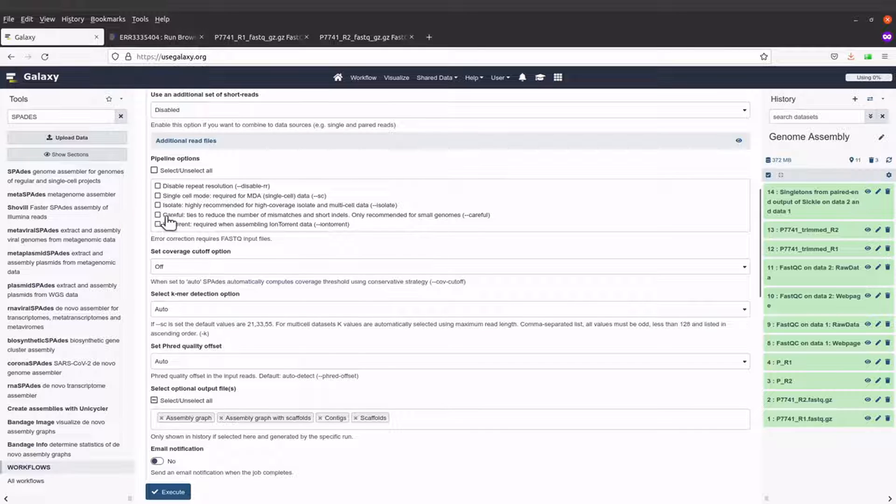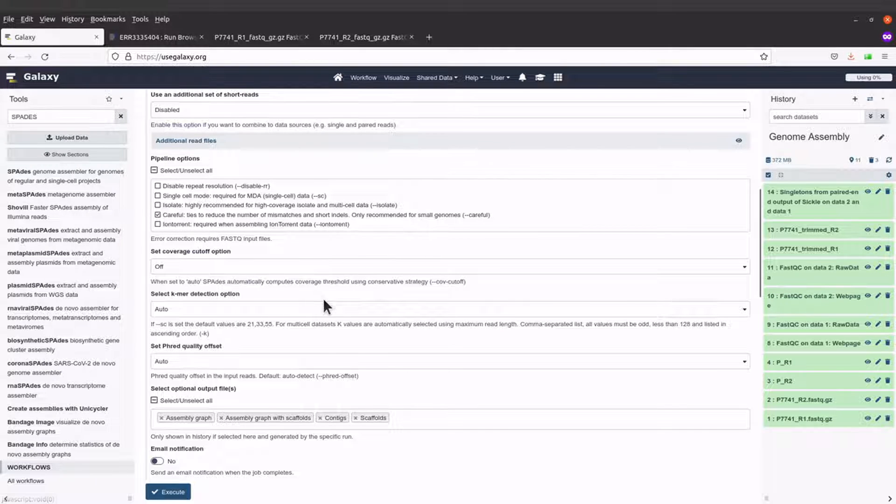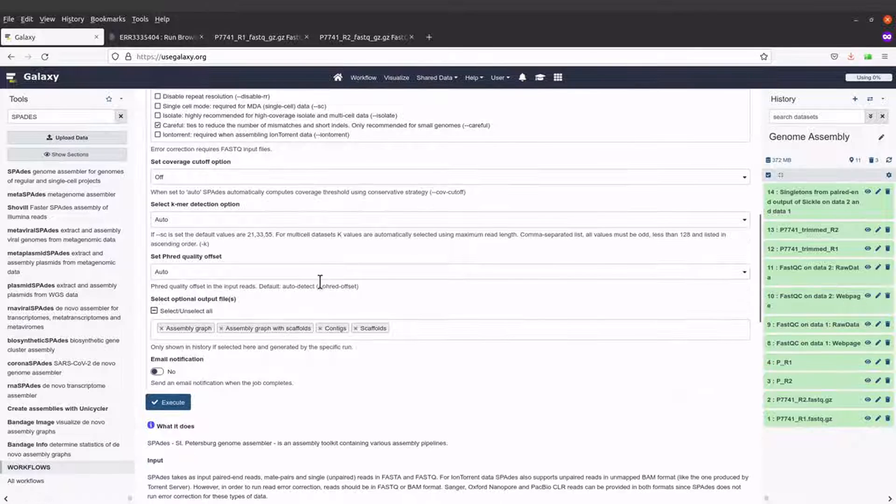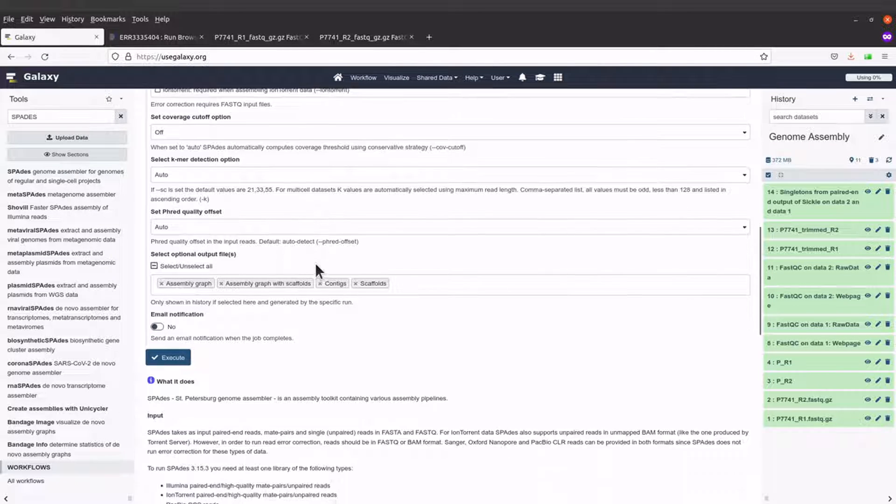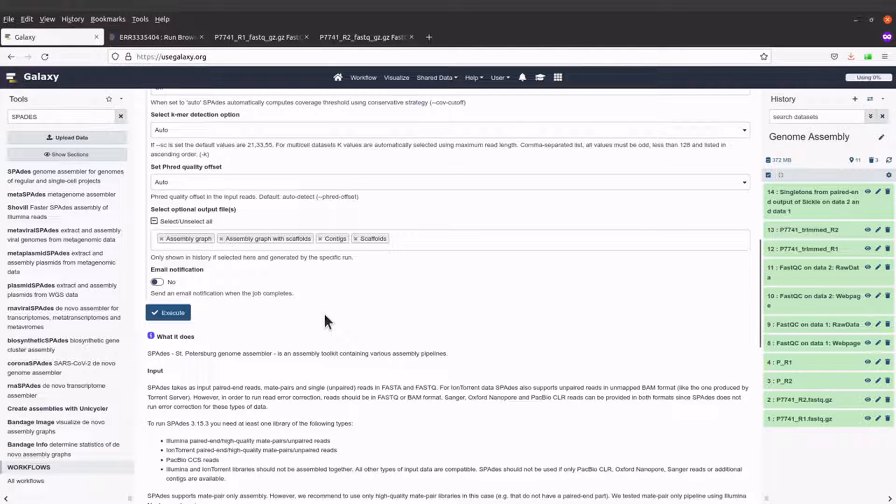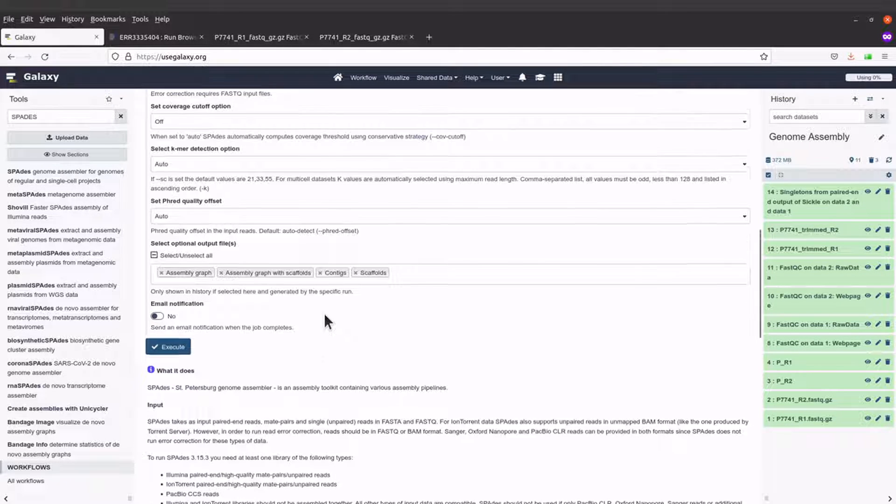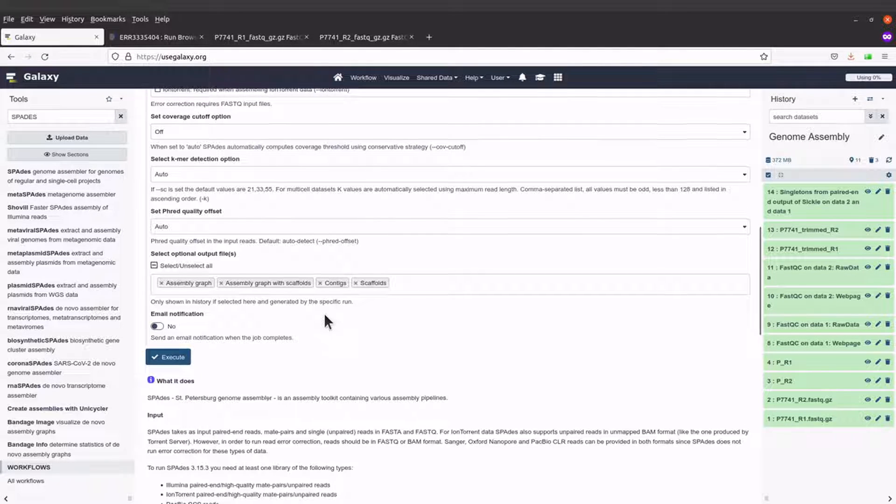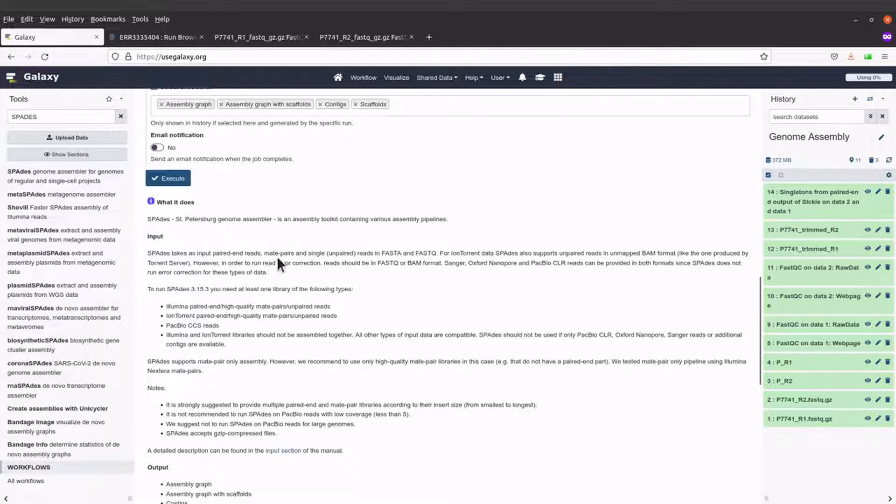So I'll use the careful flag here, and the others I will leave as they are. That's about it.